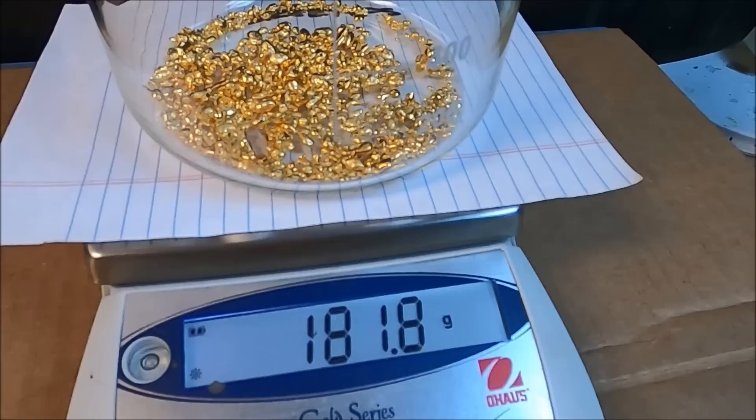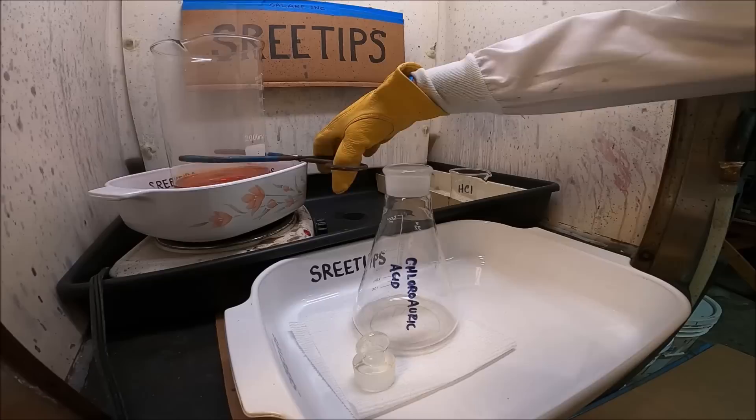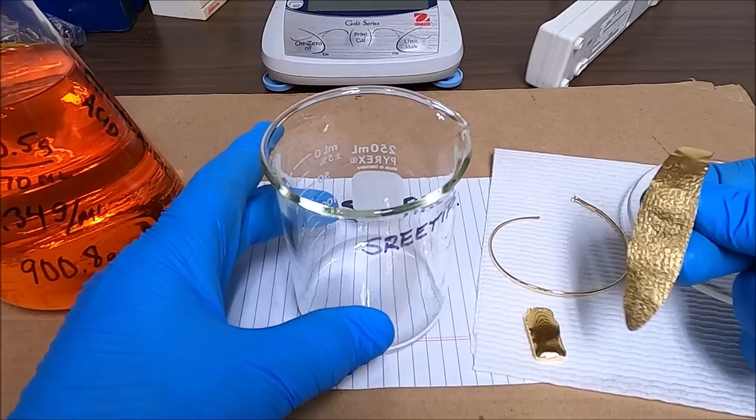Next we add the pure gold granules to a beaker, cover them with hydrochloric acid, put it up on the heat and then start adding doses of nitric acid to dissolve the gold. This will be our electrolyte for the electrolytic gold cell.